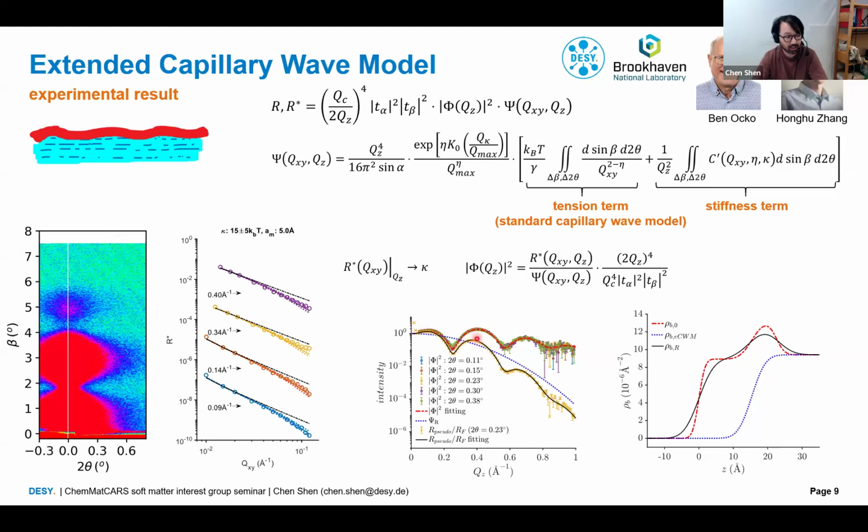But here what you see is the overlaying intrinsic structure factor from 5 different off-specular positions. They just lie on top of each other. So the analysis is independent of where one does the off-specular line cut to get the structure factor. Otherwise, if that would not work, that would mean that our theory would be wrong. And that's how we ended up with this intrinsic structure, because we get the structure factor, and that also gives us the opportunity to really know the contribution of this roughness factor.